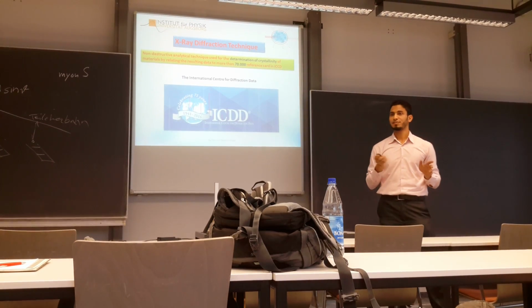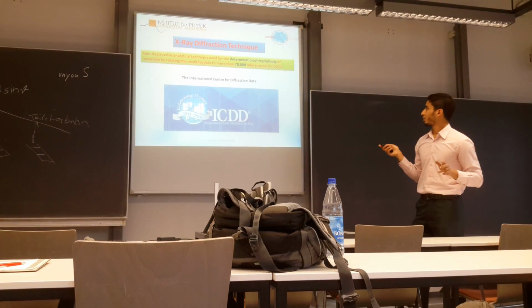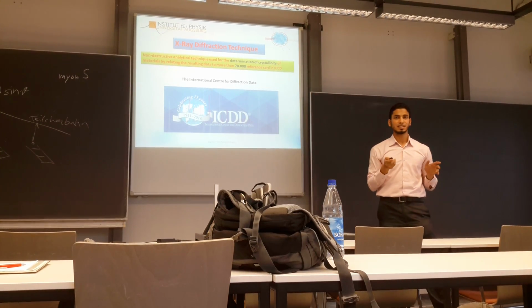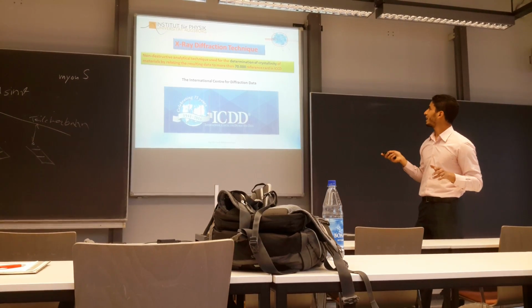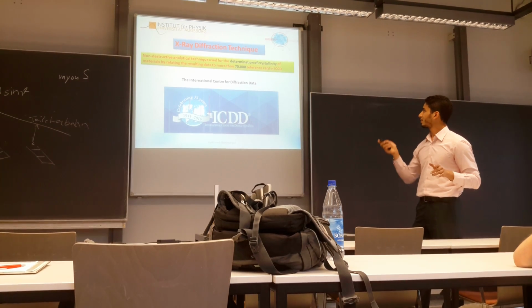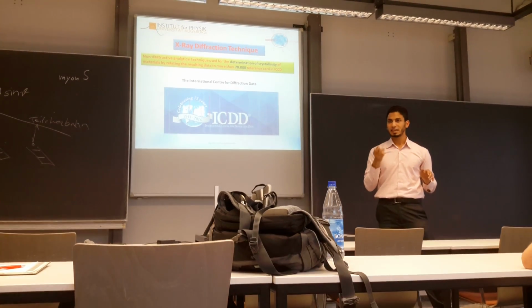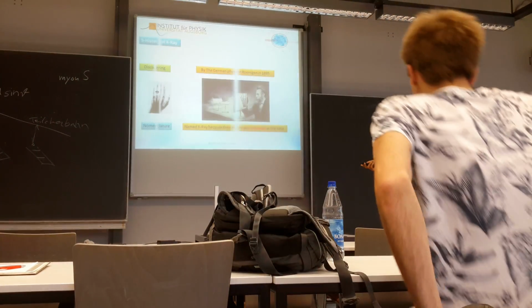What is X-ray diffraction? X-ray diffraction is a non-destructive technique used for determination of the crystallinity of material, depending on more than 70,000 references in the International Centre for Diffraction Data, by relating the resulting peaks to these references.